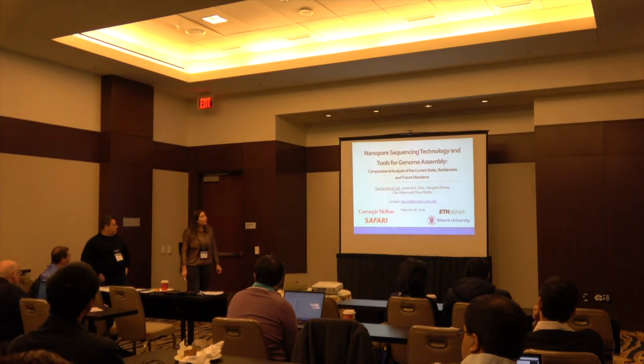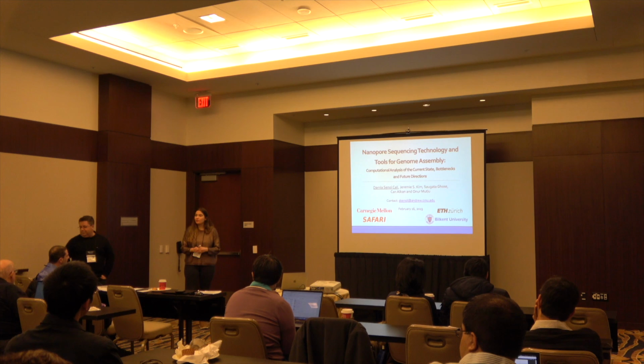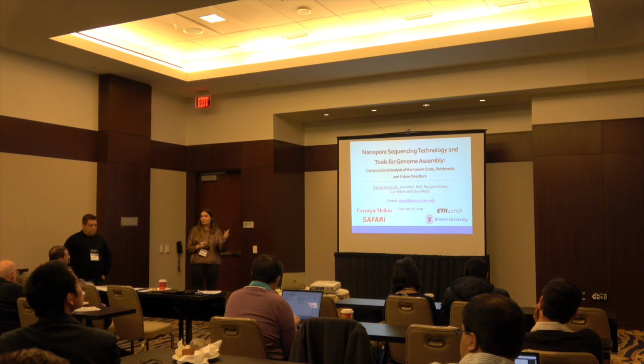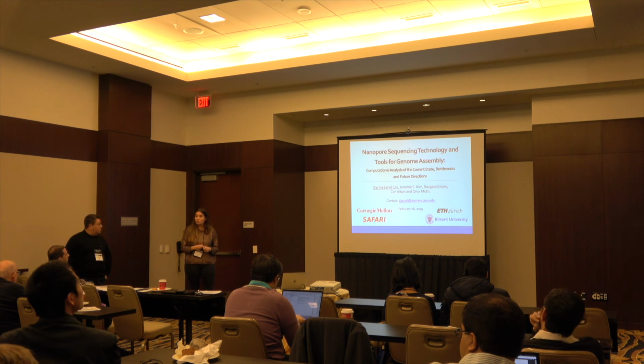So currently we are focusing on read mapping, but the main bottleneck of the full pipeline is basecalling, because it's the most time-consuming part, and it's a critical part to overcome the error rates. So basecalling is the most important step of the pipeline.